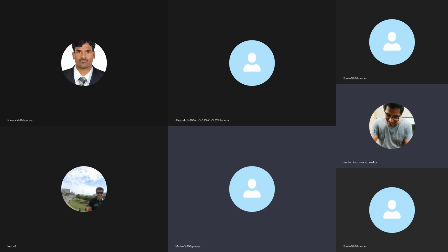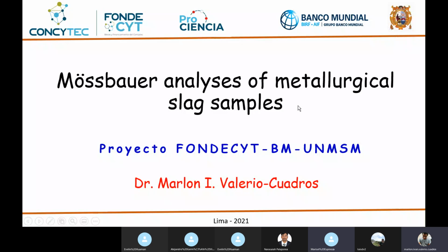Today I'm going to talk about the Mössbauer analysis of metallurgical slag samples. In this presentation, I'm going to talk about all the samples that we measured by X-ray diffraction and Mössbauer spectroscopy, including measurements at room temperature and at 50 Kelvin.